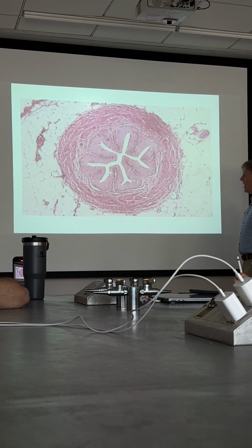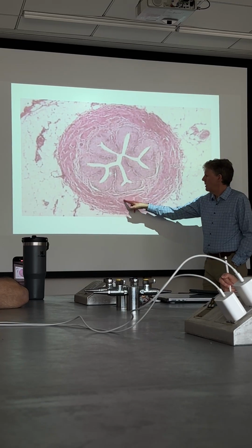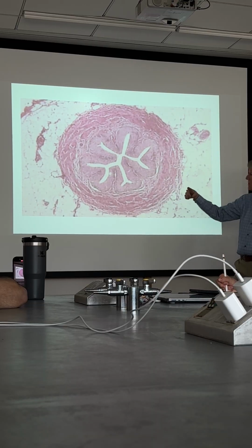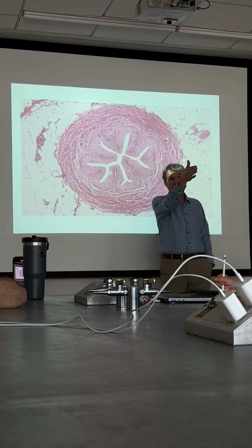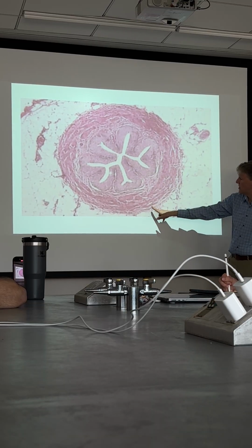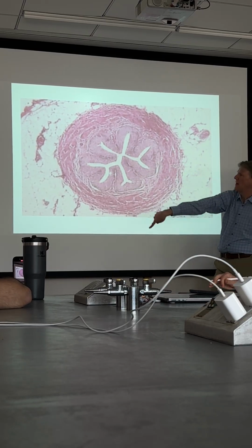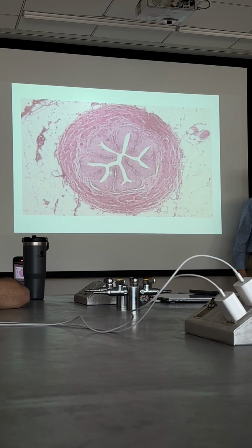And again, it's kind of hard to see the two separate layers, but just know that the inner layer should be longitudinal, which means on a view like this, the muscle fibers are coming out towards you, right? Versus the outer layer is going to be circular, which means the muscle fibers are going around in that kind of direction. Okay?